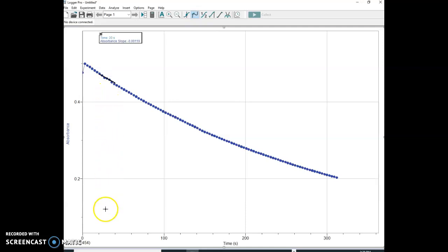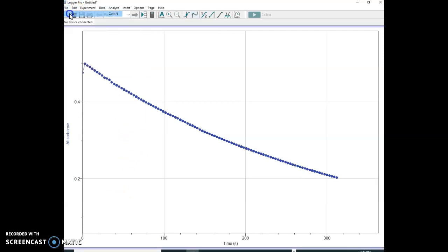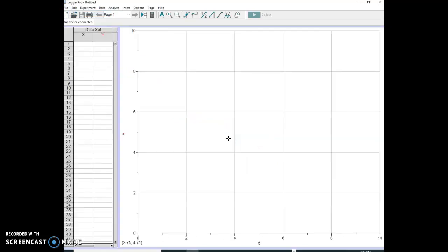Now, you're then going to get an XY axis. Let's just do that so you'll see what to do. And you can type in the molarity here for X, and molarity of hydroxide here. They'll go down here. And the Y would be the slope, which you would call the rate. And you're going to have 1, 2, 3, 4. And you will get a graph here. And that's the second thing you need to report for your laboratory report.